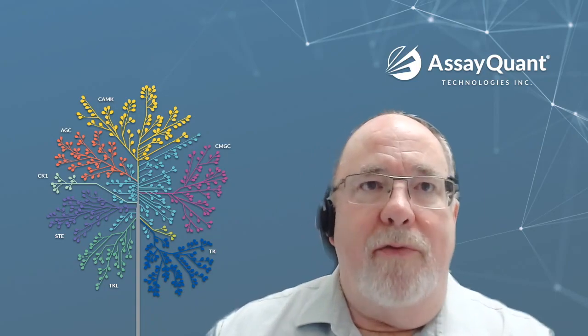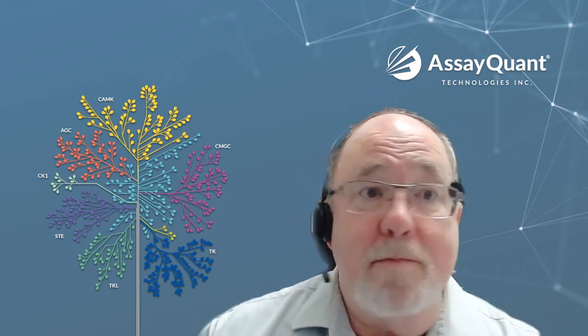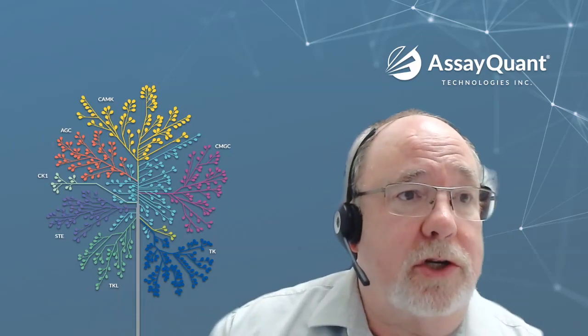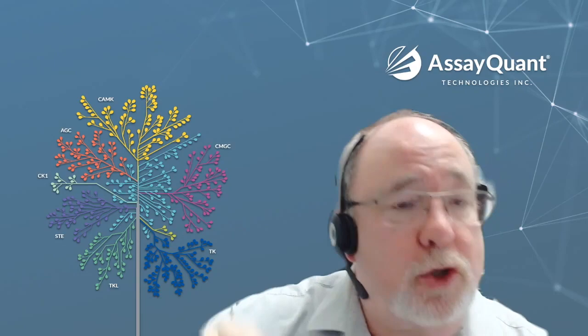In terms of what experiments to do in parallel, you get more information if you do it at both ATP concentrations: at 1 millimolar, close to physiological, or at the KM for each individual enzyme. That will give you a quick take on the mode of inhibition of that enzyme, how ATP competitive it is.